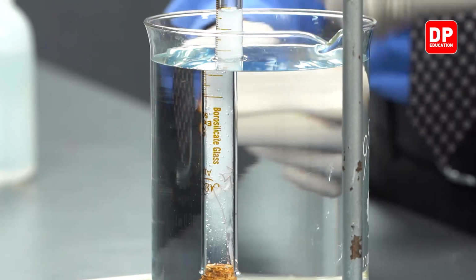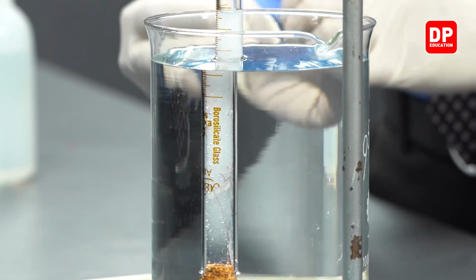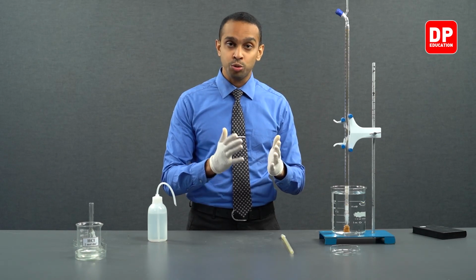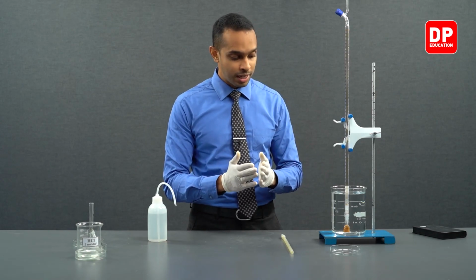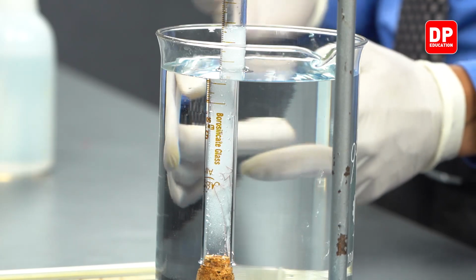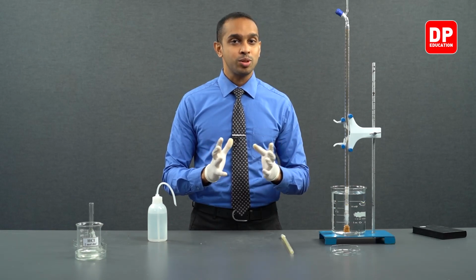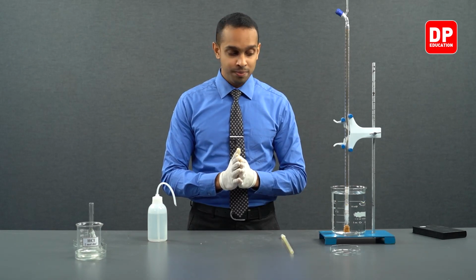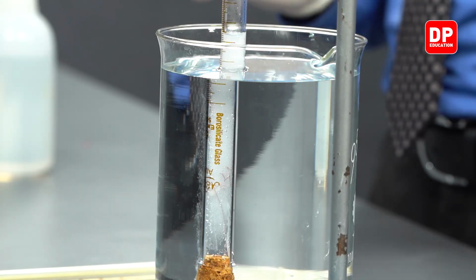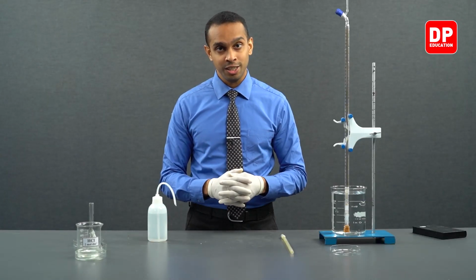If you pay attention to over here, the magnesium strip that was present over here has little by little gotten smaller and smaller as it reacts with the HCl, and a part of it has broken down and gone to the bottom as well. You can see that is also still reacting with HCl and producing hydrogen gas. But after the magnesium strip has completely reacted, you would see that the water level will not move downward anymore, as all of the magnesium has completely reacted with HCl. There will be no more production of hydrogen.